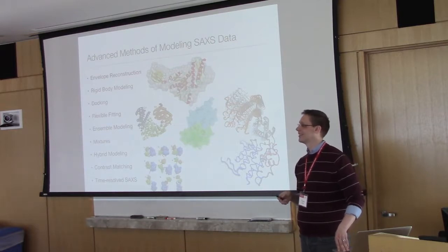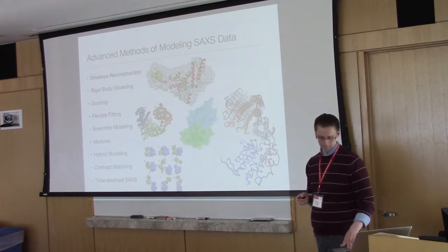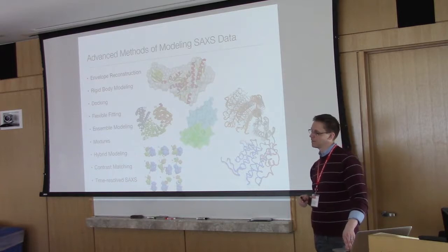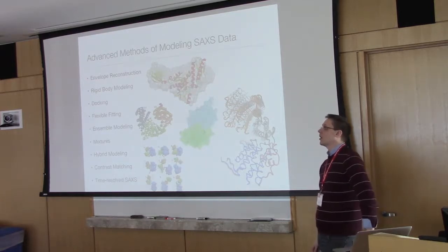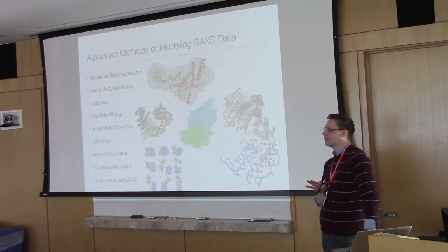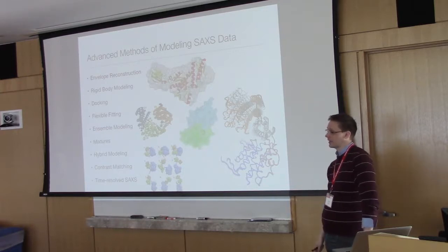Yes? So can you separate out from that sort of one-dimensional curve, let's say, two different sets of ensembles? There are potentially some ways of doing this. Kushal mentions later, I think, ensemble modeling, and there are ways of trying to cluster these ensembles to do exactly that. So if you have 60-40, can you pull the 40 out?